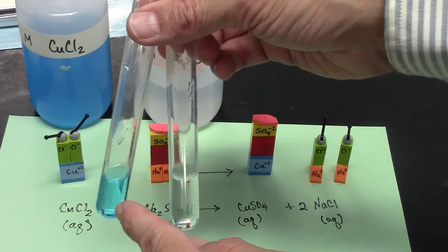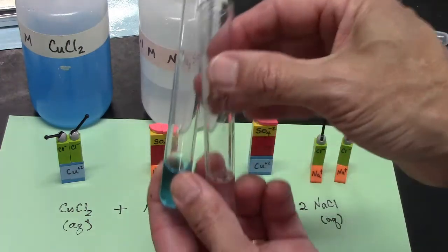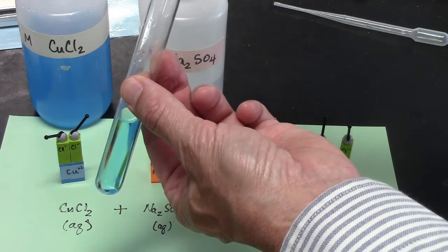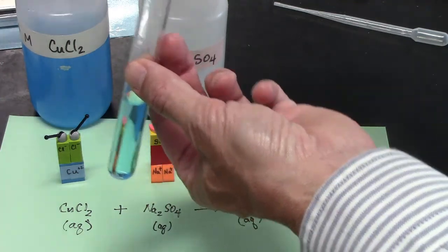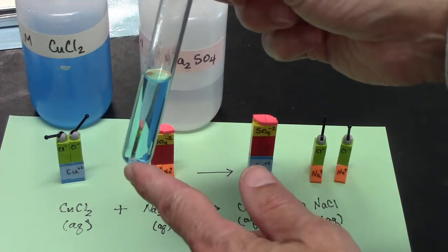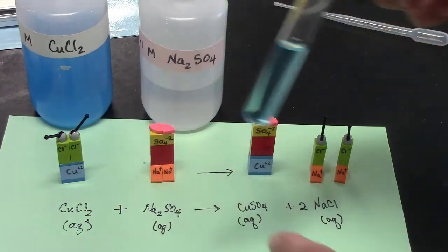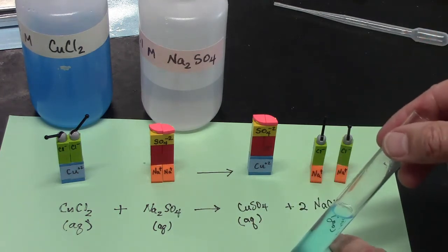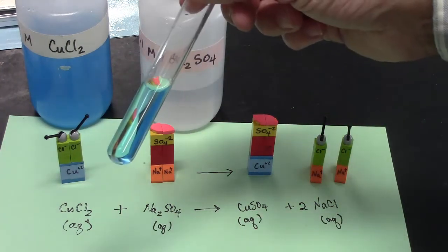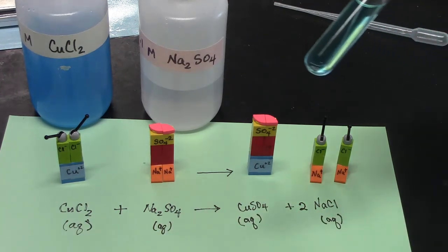Here they are. The copper chloride is blue. The sodium sulfate is colorless. There they are. When I mix them together, I think you can see it's pretty boring. There's no obvious new substance formed. It's clear, transparent, which means the products are dissolved. The symbolic language helped me predict this would be the outcome. Both products are soluble, so no solid will be observed.